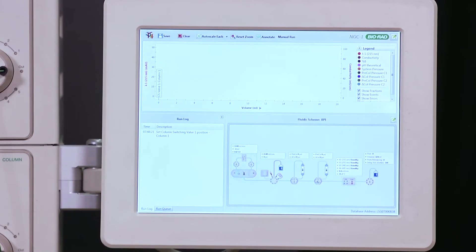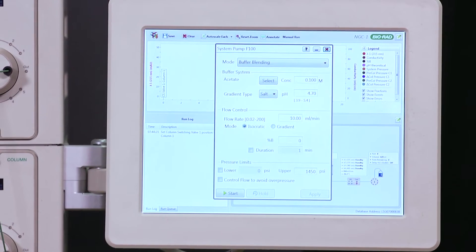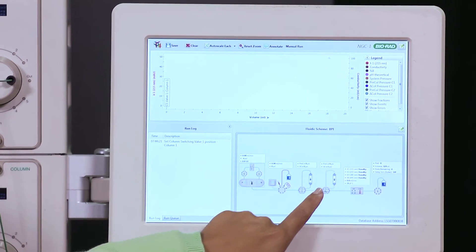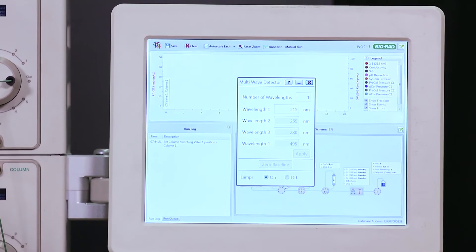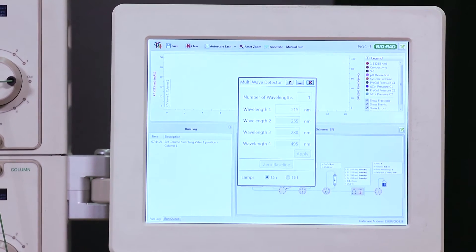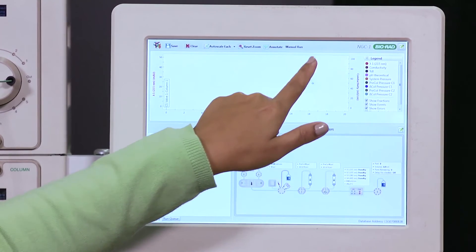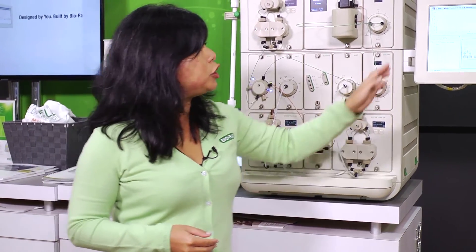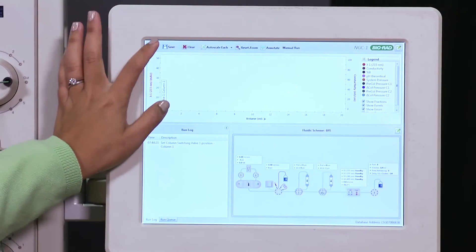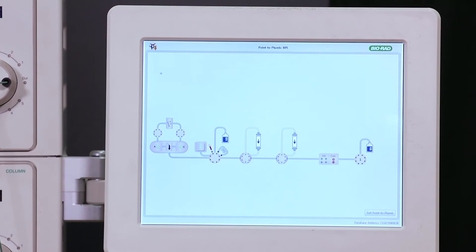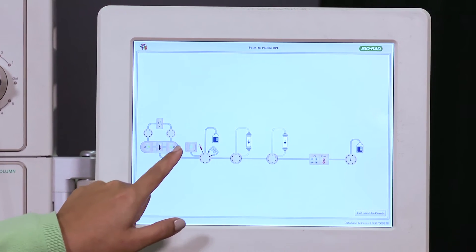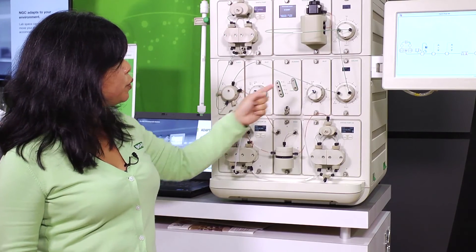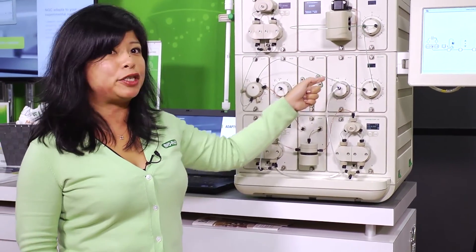You can click on any of the faceplates and change the flow rate of buffers, and enter in different wavelengths for whatever you need to detect. For those who have multiple users in the lab that may need different modules, you can also change the configuration. And when you need help plumbing that new configuration, you can use Point to Plumb — choose the different connectors and it will show you exactly where you need to connect the different tubing.